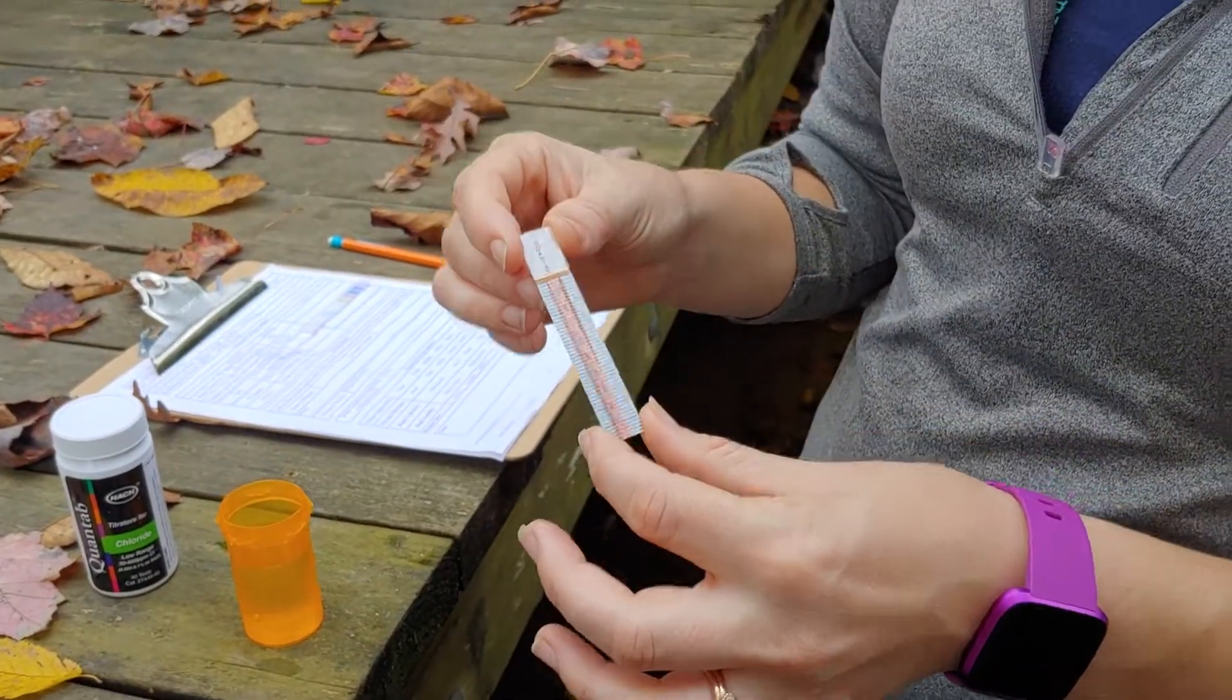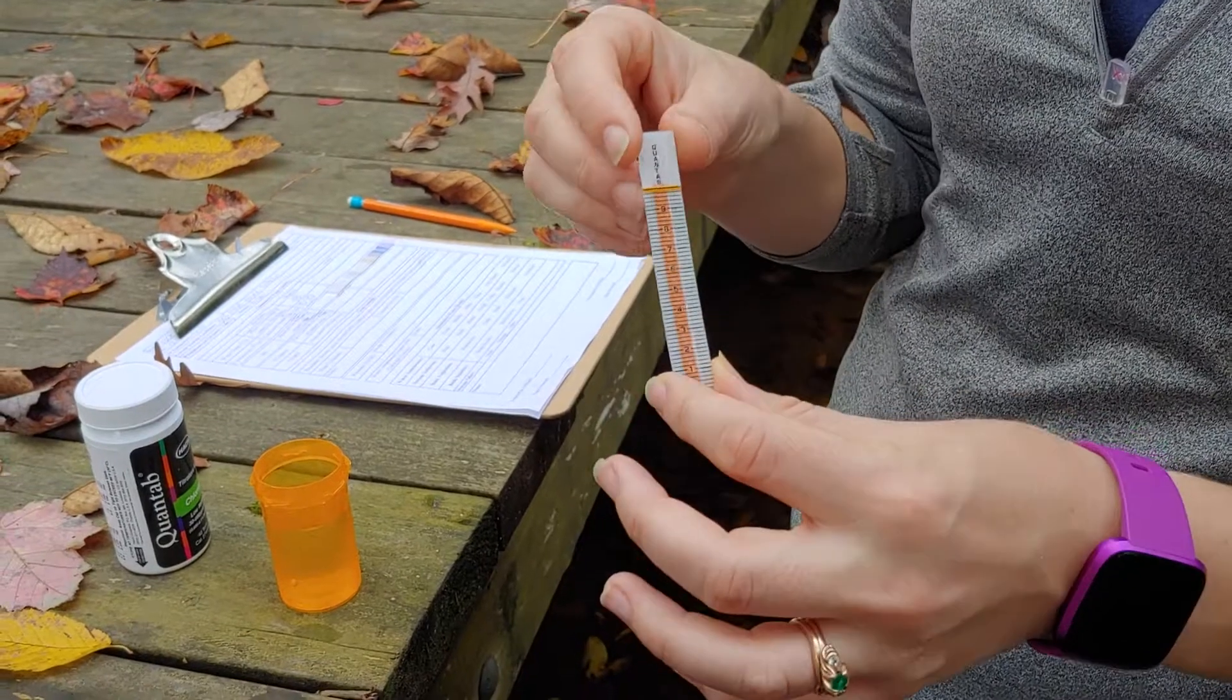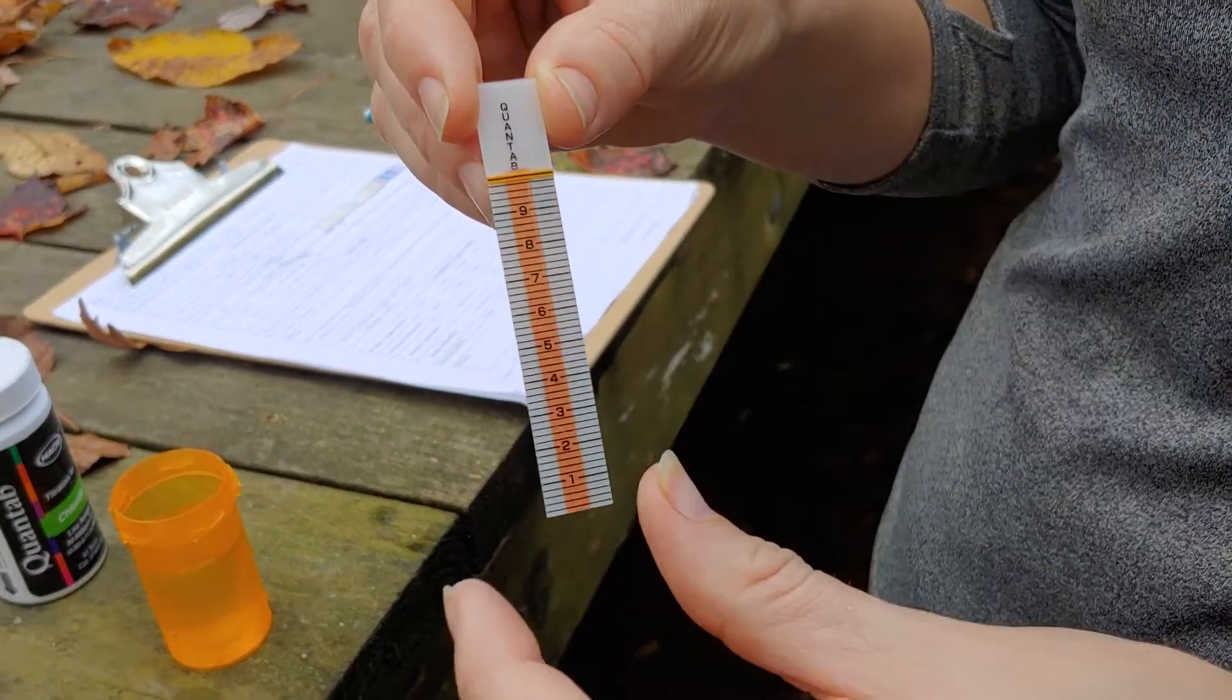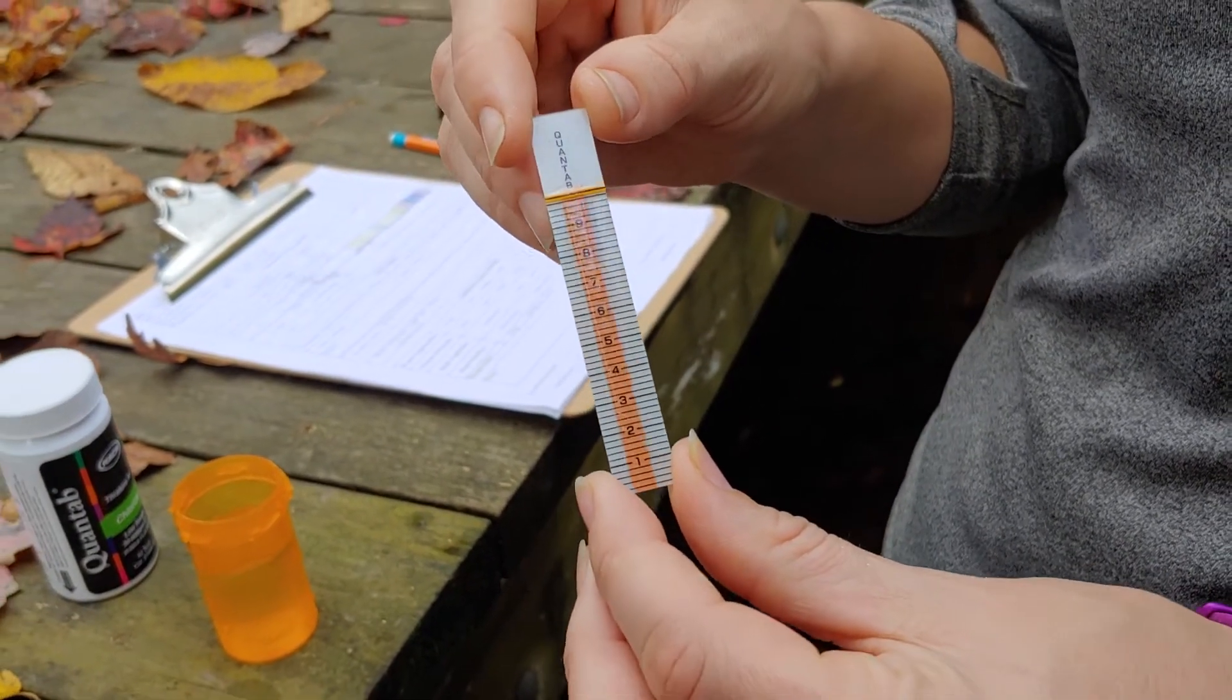Next we're going to do our chloride strips, and these are a little different than the pH strips. There is an indicator line at the top that changes from orange to black when it is done taking its reading.